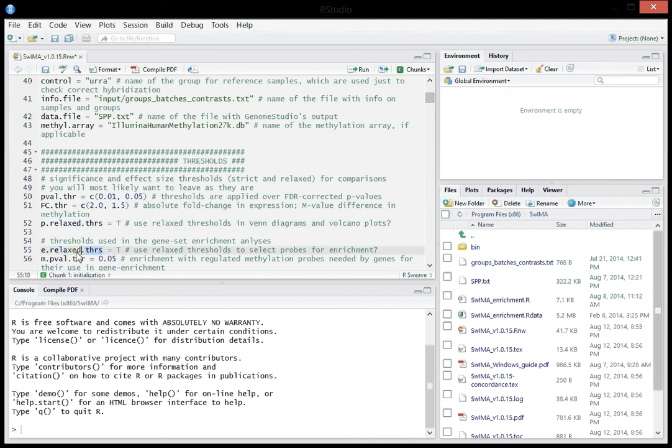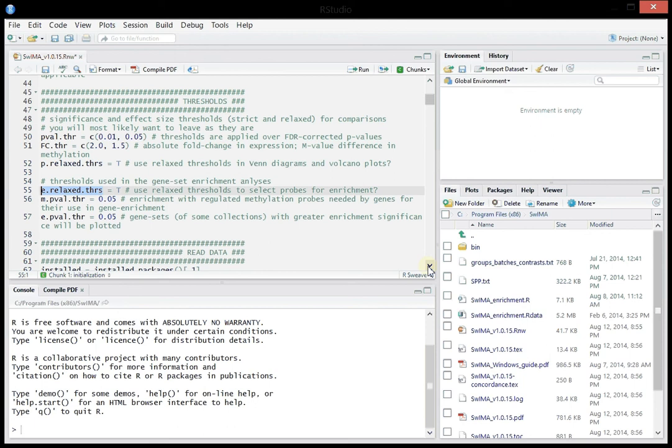The high-density Illumina Infinium HumanMethylation450 microarray contains a huge amount of probes for certain genes, making them much more likely to present significant probes just by chance. Put a threshold here to delimit the p-value of the statistical test. That keeps for gene set enrichment only those genes with more significant probes than expected.